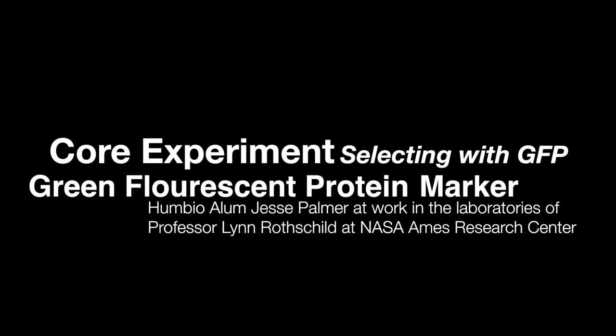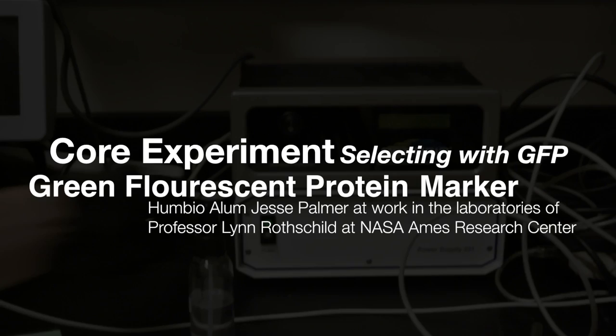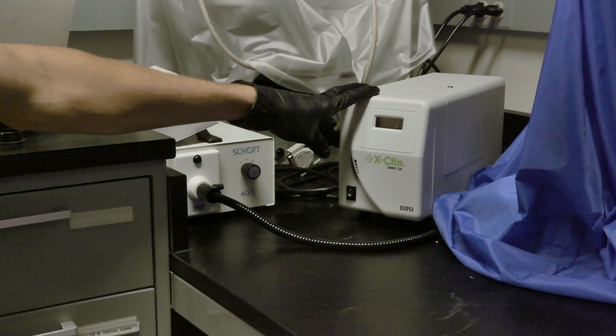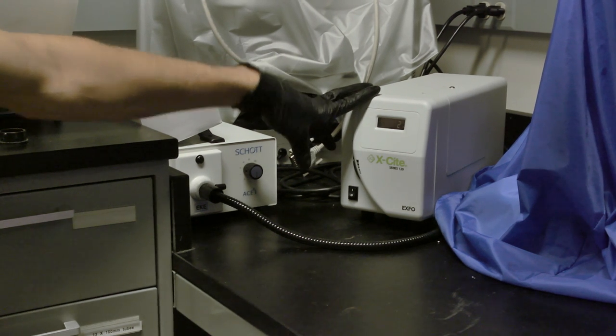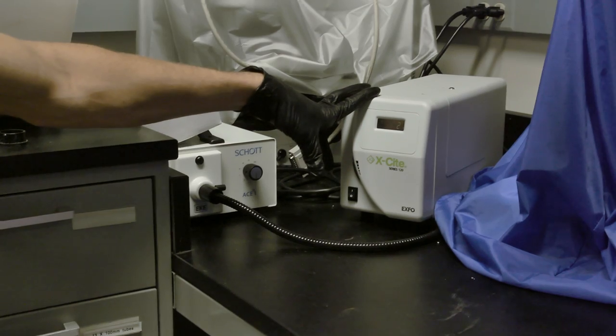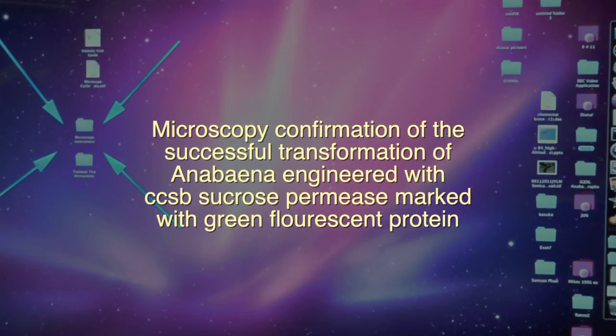Okay, so first I'm going to turn on the power supply over here and then turn on the microscope itself. I've already turned on the fluorescent excitation source over here. It takes about five to ten minutes to warm up in order to get the best visual of our GFP fluorescence that we're going to be looking for. And while the microscope is warming up, I'm going to go over here to the computer. So we use a program called Velocity to do our microscope imaging.